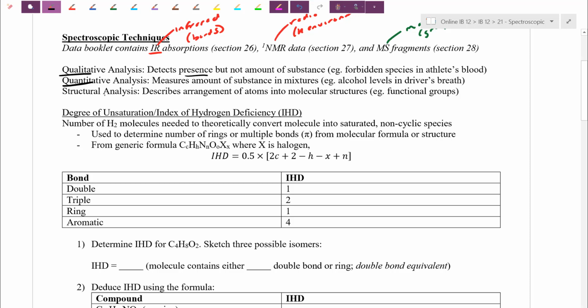We are going to take down the evidence that we get from all these different modes to try to do some structural analysis, to try to actually figure out not just what chemical we have, how many carbons, how many hydrogens, but also the arrangement. So I would be interested in what sort of functional groups, right? Because that's going to tell me some behaviors, maybe which isomer I have. We found that especially when things start getting larger, we can have structural isomers, I can have stereoisomers, R/S, E/Z, all those things.